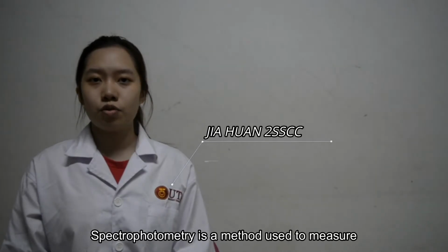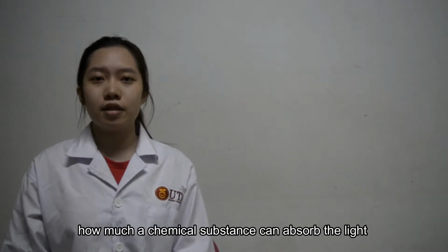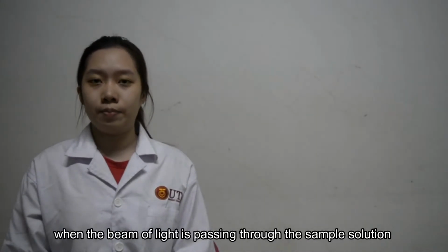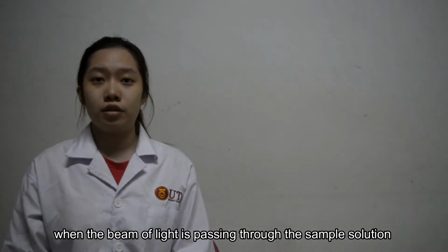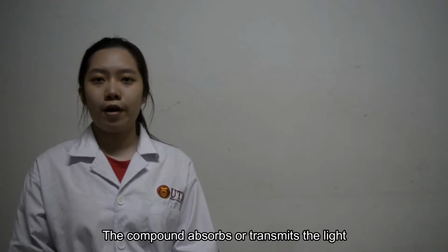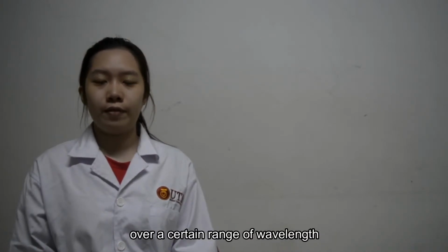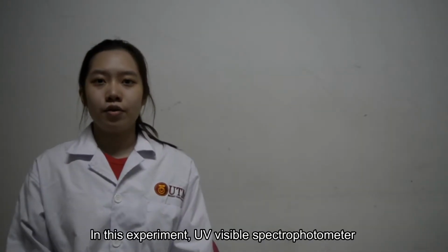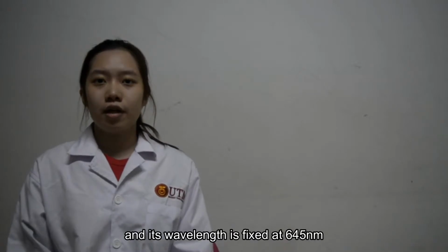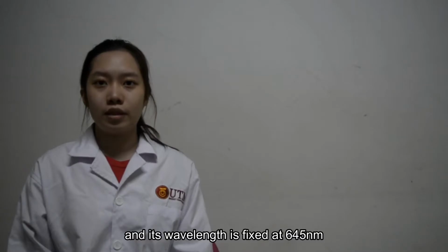Spectrophotometry is a method used to measure how much a chemical substance can absorb light by measuring the intensity of light when the beam of light is passing through the sample solution. The basic principle is that the compound absorbs or transmits light over a certain range of wavelength. In this experiment, a UV visible spectrophotometer is used as a light source and its wavelength is fixed at 645 nanometers.